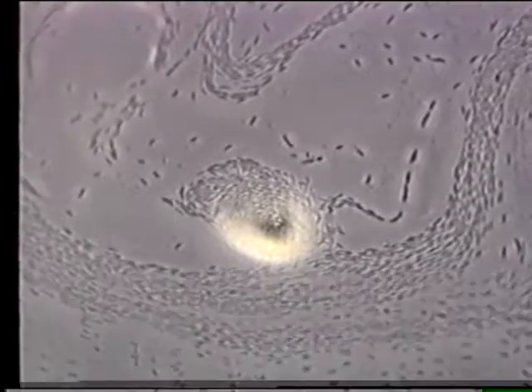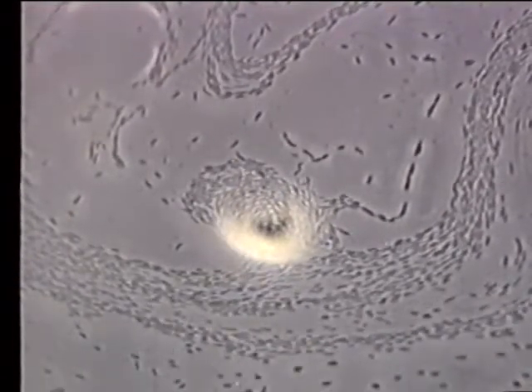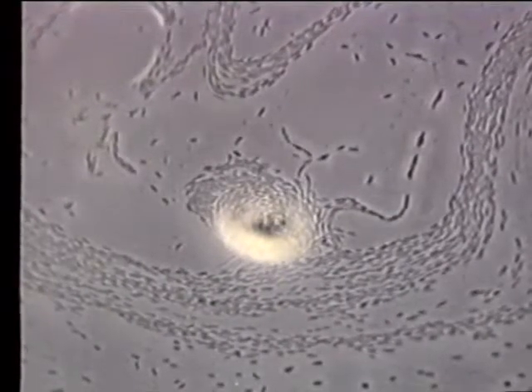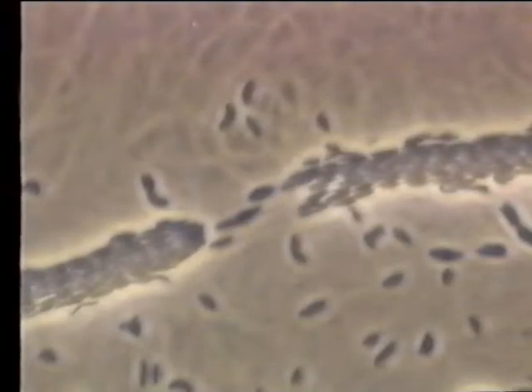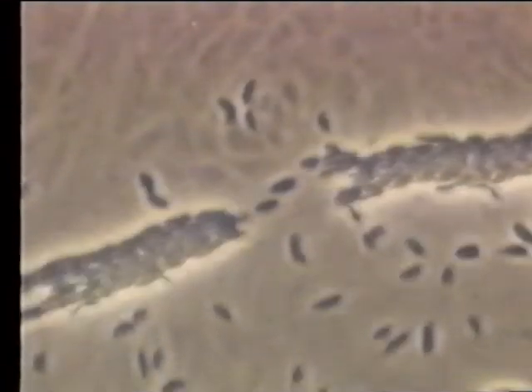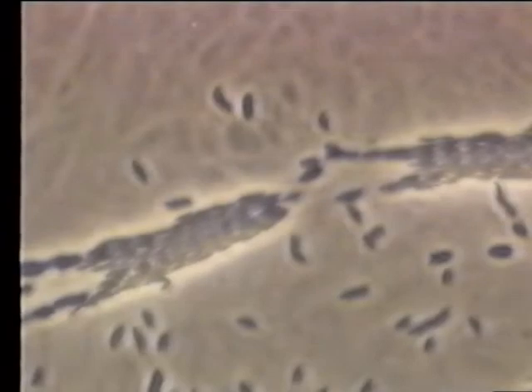Now you can see the cells gliding on agar. They glide very slowly, and this has been speeded up 5 times in order for you to see them gliding. And here is another view. Not all the cells are gliding, but they will glide later. They periodically stop and start gliding. Notice they seem to glide in groups, which is common for myxobacteria, and it looks actually like a stream of cells.